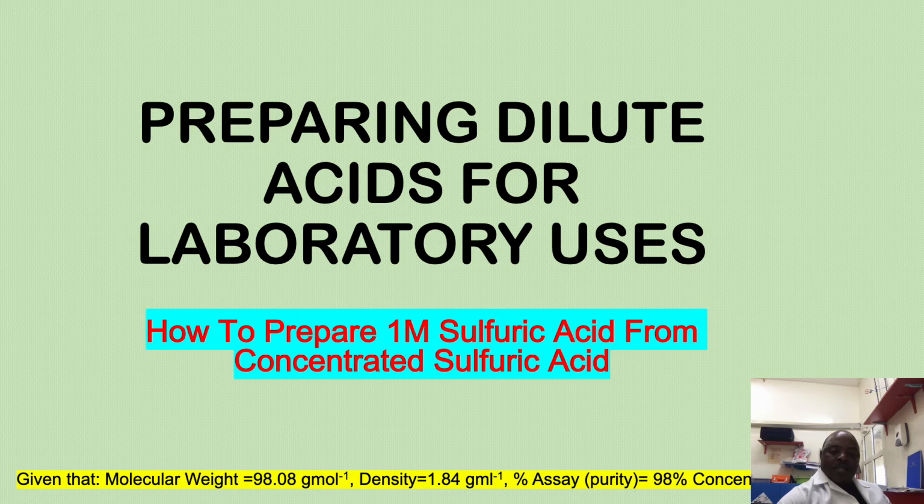This is from scratch. You have the manufacturer product in the bottle where the acid is in a liquid form. On the bottle, you are given the molecular weight as 98.08 gram per mole. You are given the density as 1.84 gram per ml. Percentage assay under the purity is given as 98% concentrated acid.